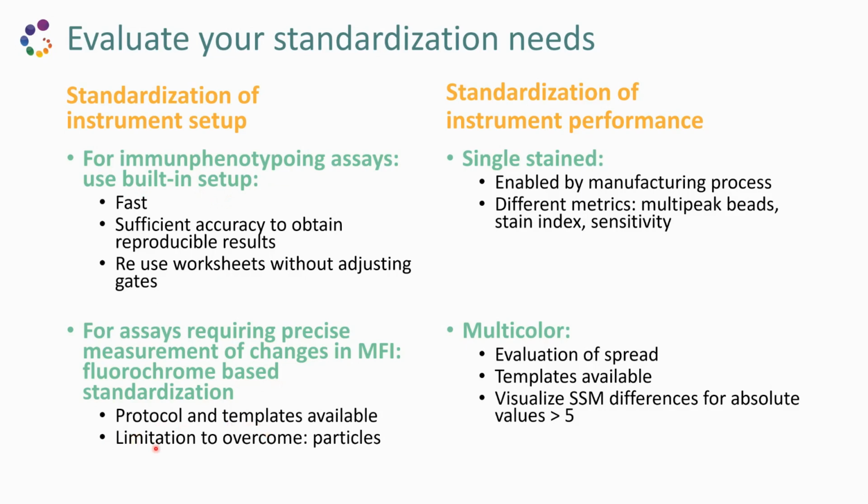The limitation that we have to overcome and brainstorm is what particles we're going to use. When it comes to instrument performance, please do a good maintenance of your system. Be very good at cleaning. If you don't clean well, you're going to be penalized with optical noise, and if the optical noise comes high, you're going to compromise your resolution.